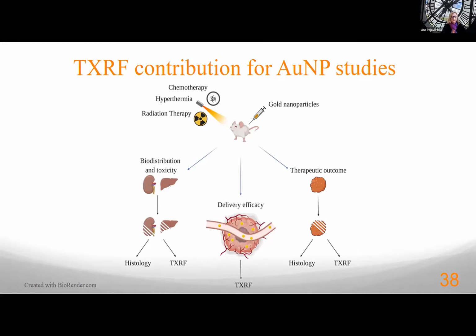So where we are now in respect of using TXRF is that we can support any research around gold nanoparticles today in nanomedicine. So we can follow combo therapies or direct therapies based on the gold nanoparticles, ideally being able to quantify the dose that needs to be injected into a person or animal to achieve a medical outcome. We can also look at biodistribution and toxicity in different elements, and therefore look into the kinetics of gold nanoparticles inside the body. We can also measure in histology microtome slices, and therefore probably look into distribution within the organ.